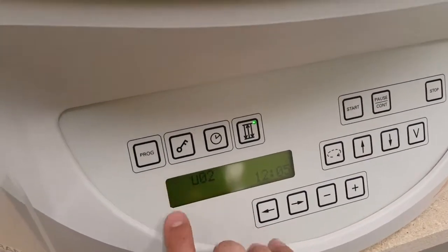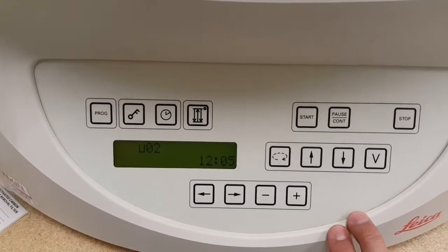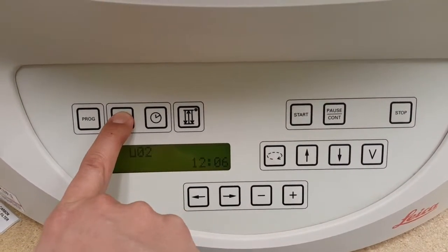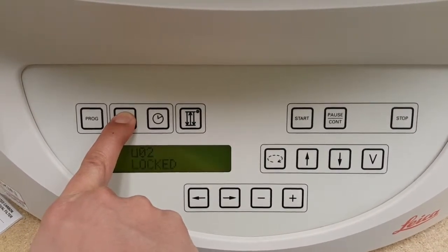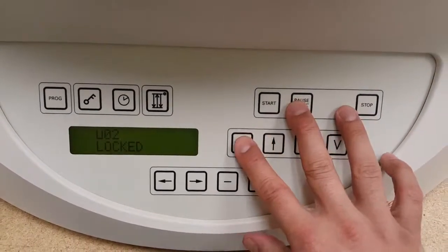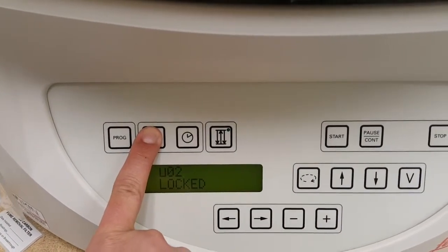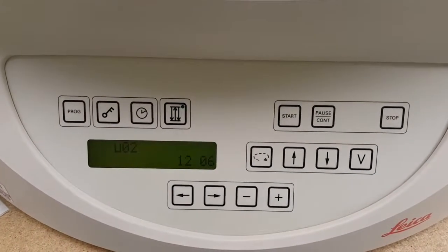The last thing is if you want to lock the machine and don't want anybody to change any of the values, you can come up here and press and hold the lock button for a few seconds and it will say locked. The only thing you'll be able to do is unlock it by pressing and holding it once again, and now it's ready to rock again.